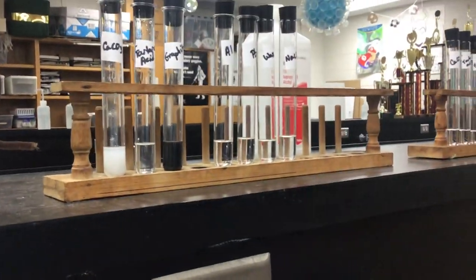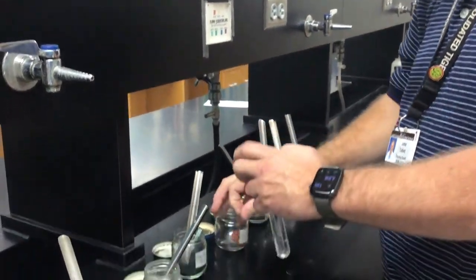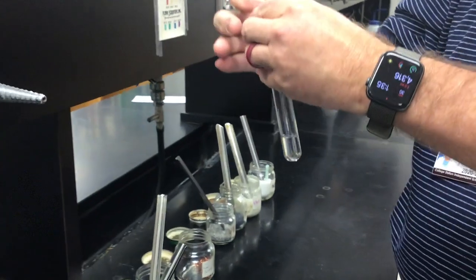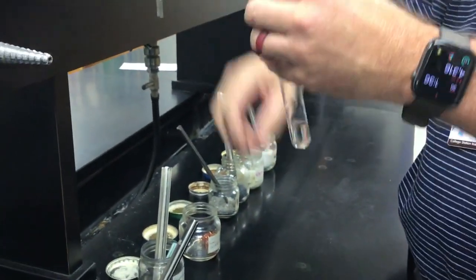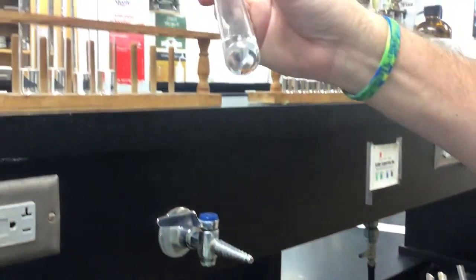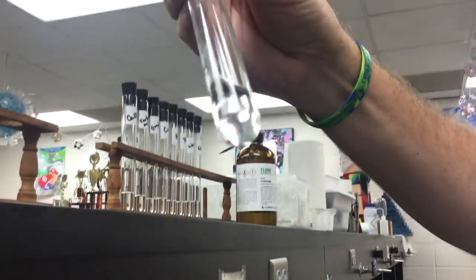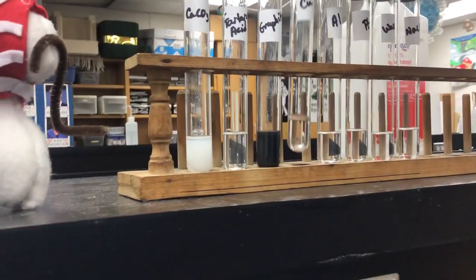Next was copper. So I've got a little bit of copper in here. I'm skipping the spatula on this. I'm not afraid of the copper. Whoops! Not dropping it in there. Let's drop it in here. We'll drop a little copper in there. We'll shake it up. Can you see the bottom of it? Yeah. Okay, so the copper is in there. We'll come back and check that out at the end as well.